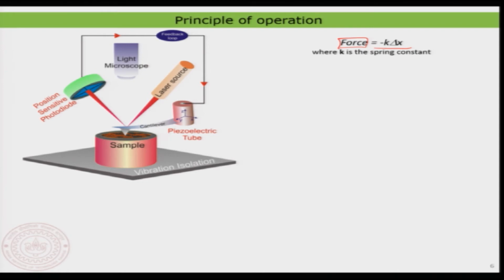Now I will come to that in the context of an atomic force microscope. I am bringing this equation in the context of an atomic force microscope, so you will understand it in better detail. So now imagine that this is the system that you are looking at, which has, most importantly, the sample. That is something that you want to investigate. Let me also put a scheme here for you to get along with. So what I am having is a topography that looks like this. Yeah, that is what the topography is, just a line scan.